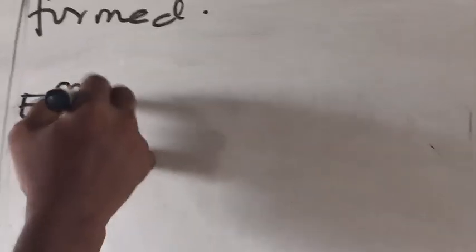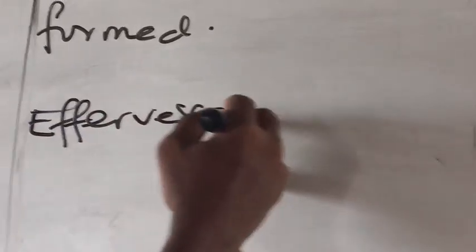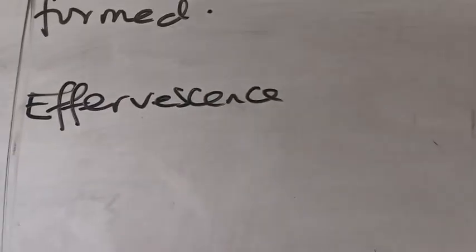Observation, we write effervescence. Effervescence means gas liberation whenever an acid is added to a substance.